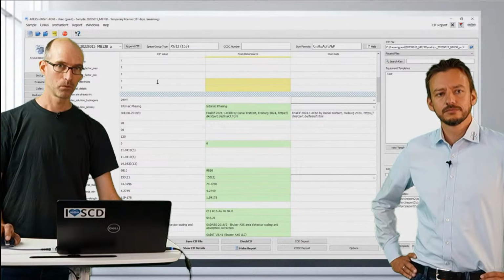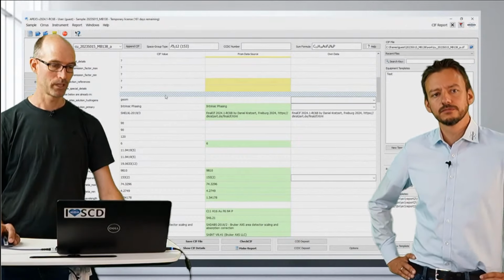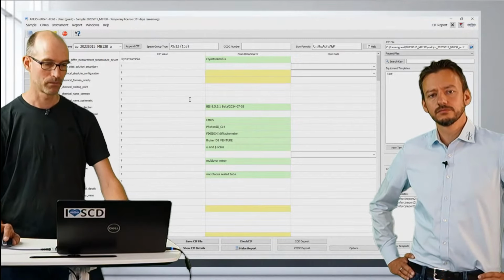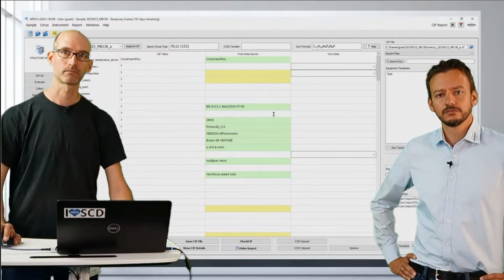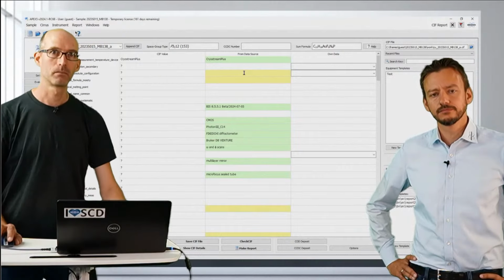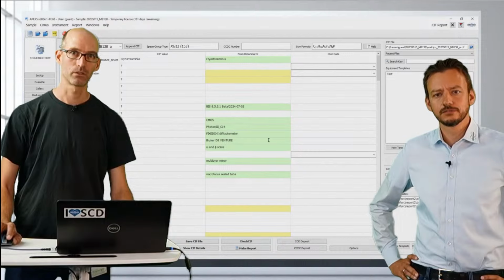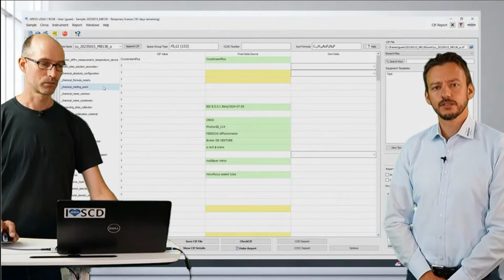One thing in addition to say about the table is that there's a line where below that line is the data that is already in the CIF, and above that line is data that is still incomplete, that either you or the software has to make complete in order to get a publishable CIF file. Mm-hmm. So I see these yellow marked fields there. What do they mean? Yellow in this case means that it is advisable to complete these data in order to get a complete CIF file, and green means that it is already in. For example, you have the chemical formula moiety here that you should put into the CIF file.